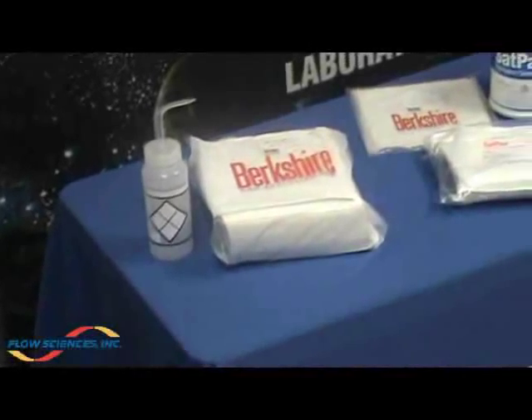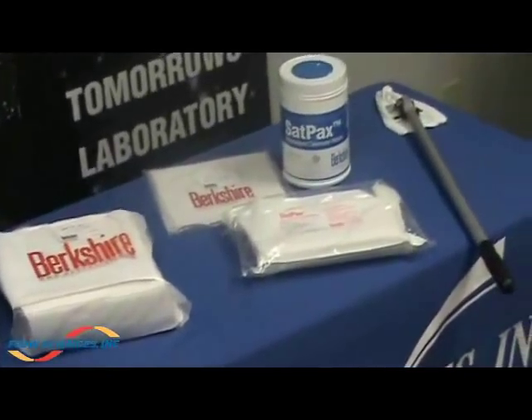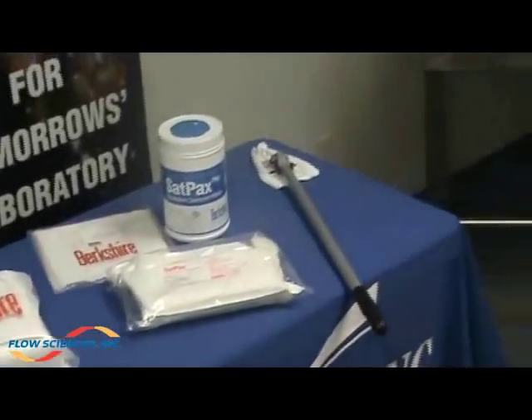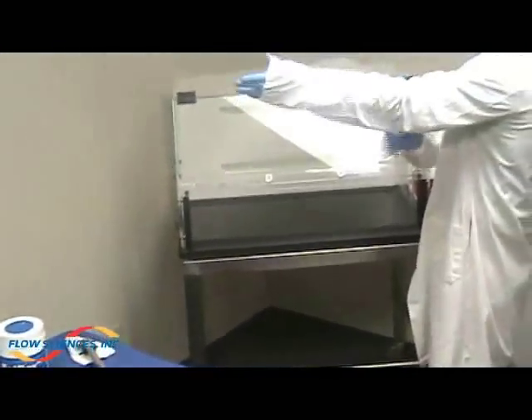Prior to cleaning, prepare cleaning solutions. Select dry or pre-saturated wipes. Gown according to written protocols.